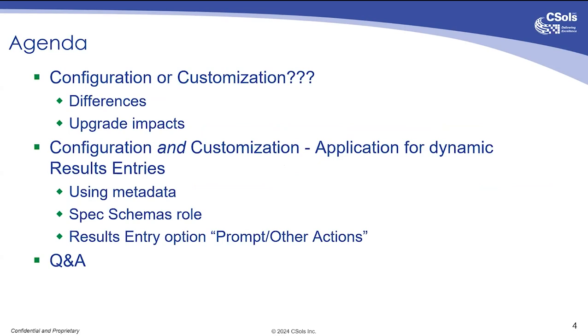I wanted to speak about this because I've seen a lot of systems already implemented that would have benefits using little-known configuration option that reduce the possibility of human error, save time, and make the system more dynamic, further adapted to business and lab processes, while keeping a low level of maintenance.